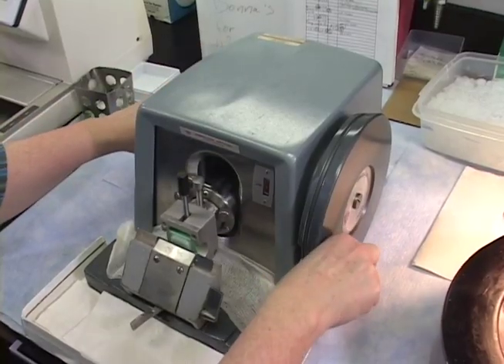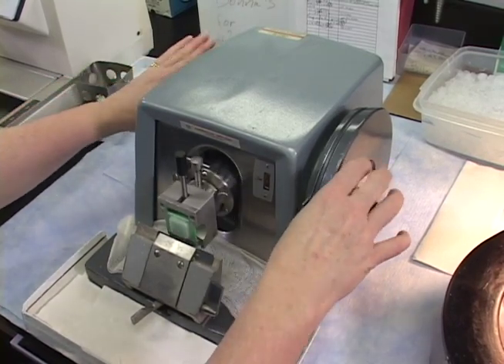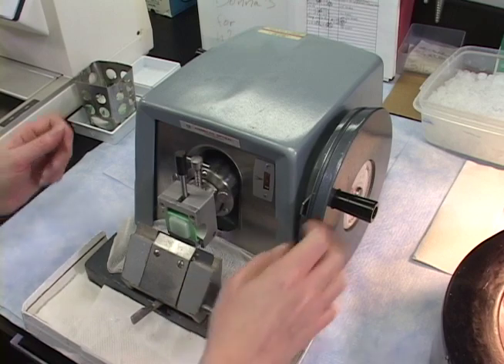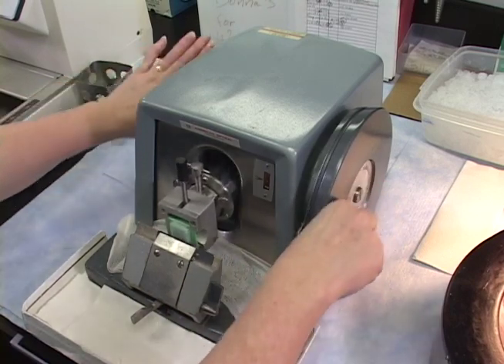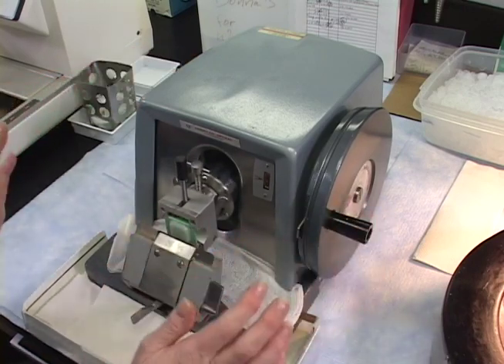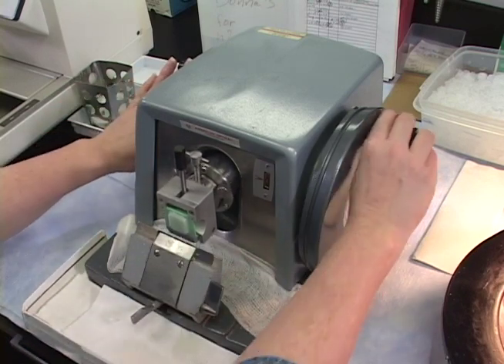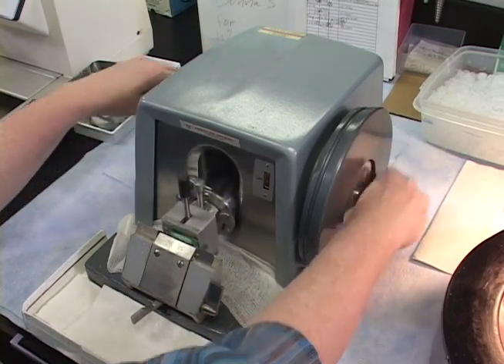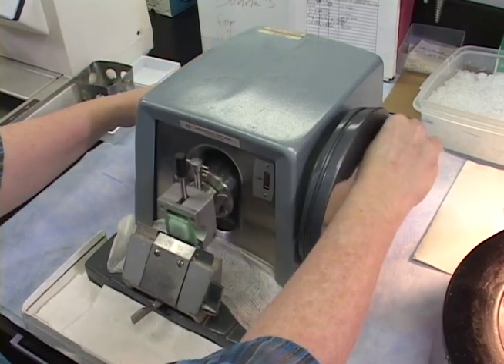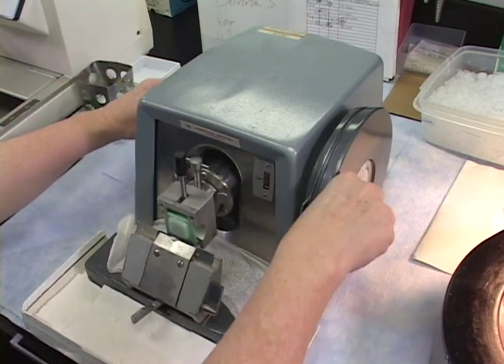Okay. So I'm slowly bringing this forward, further facing the block. Now you want to do this carefully because you want to make sure that you're not up on that blade and chunk the block out. So you're bringing it forward. I'm rocking it up and down. Now some microtomes do not handle this rocking motion very well. These older ones are fine. Some of these new ones, they do not like that. Some of the new ones, they want you to do a full rotation. And you can get in that habit for yourself. Like bringing it forward, the full rotation. And I was trained and brought up with rocking it.